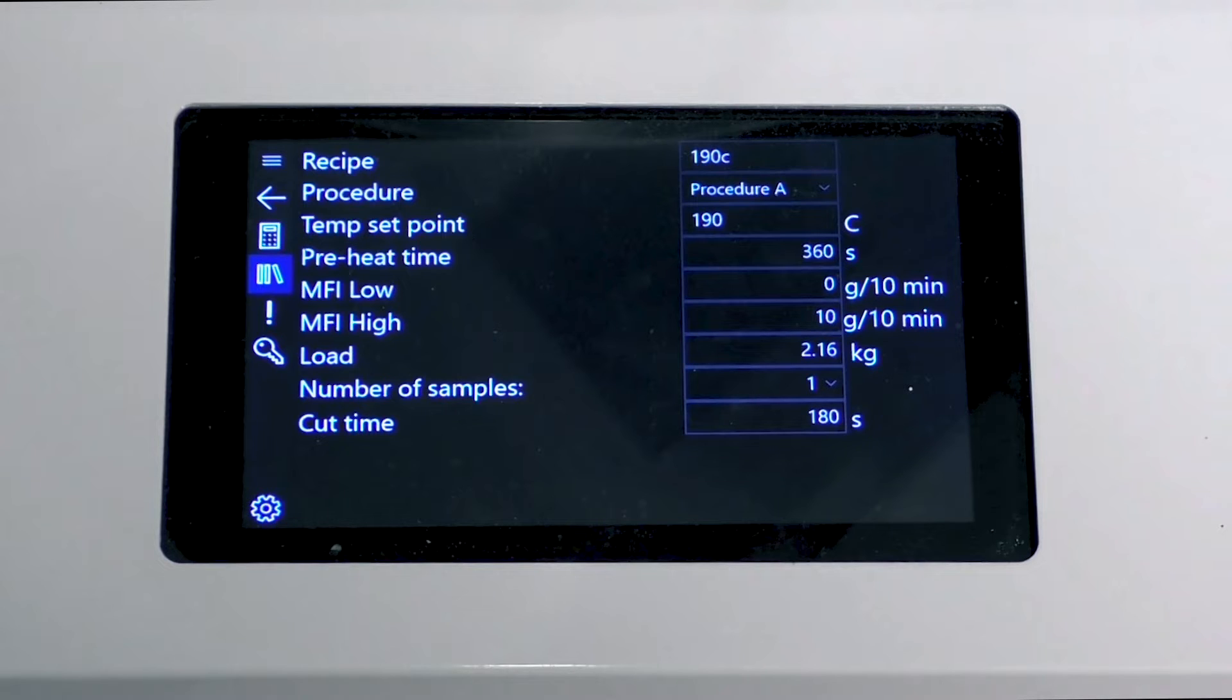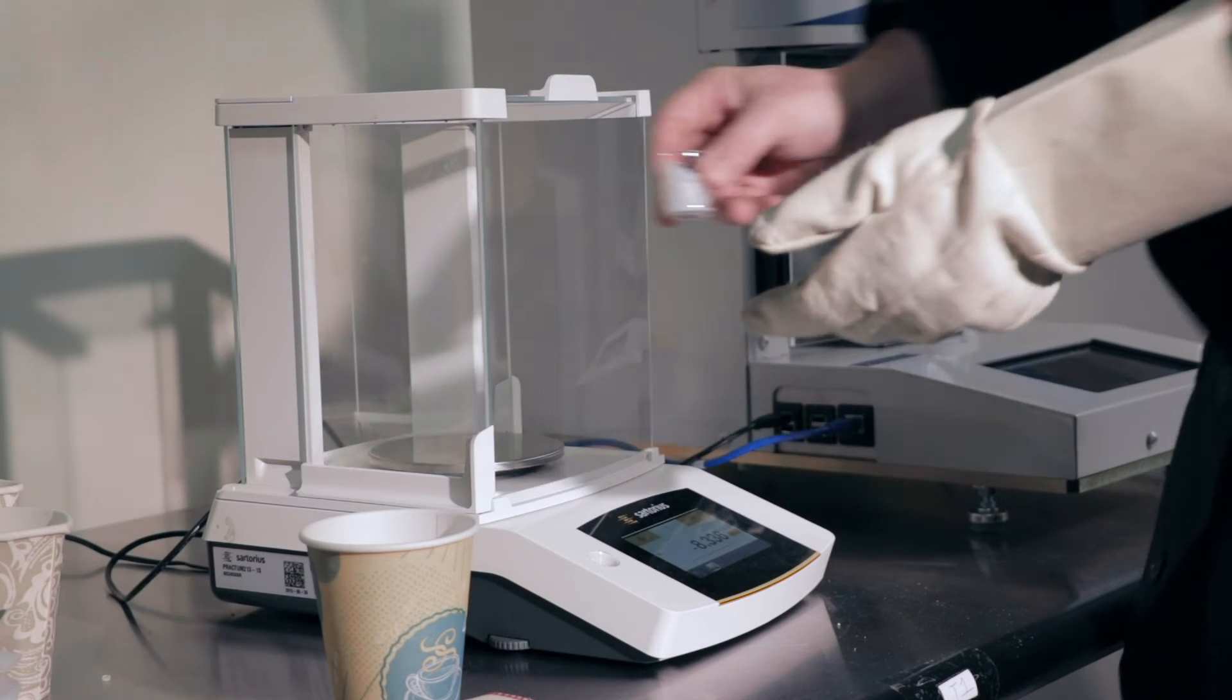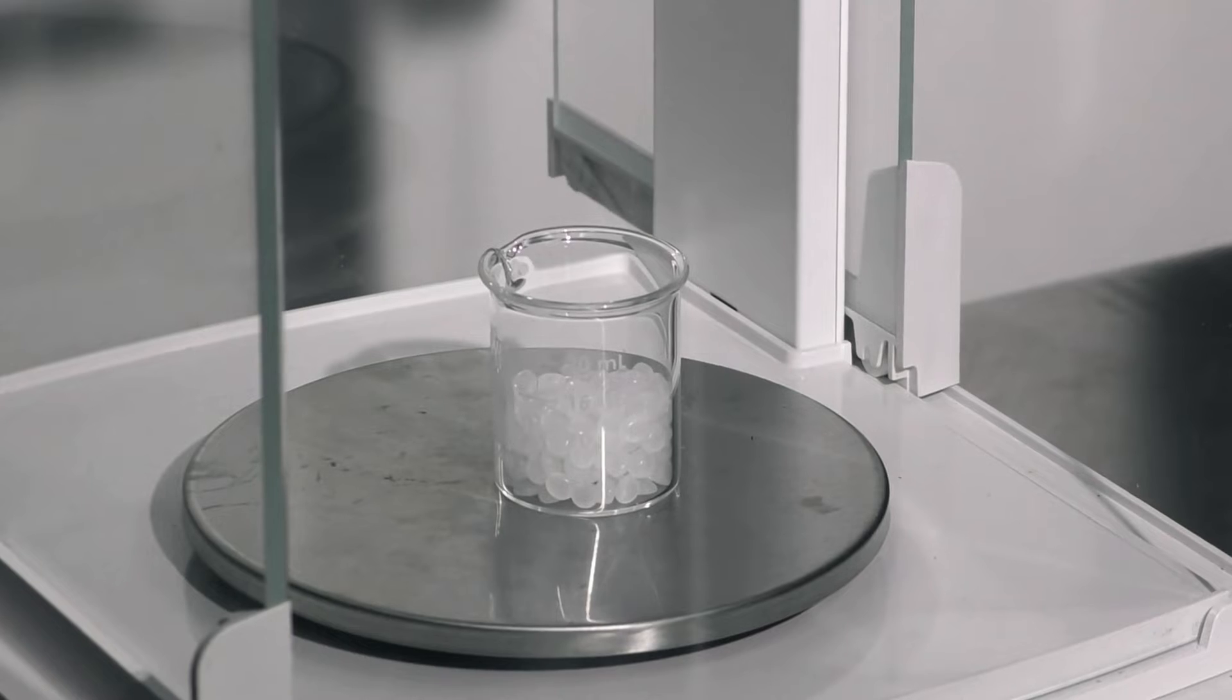The temp set point will determine at what temperature the polymer will be melted. Preheating time will clarify how long the plastic is preheated at the set temperature before the test starts. The cut time will determine how long after the preheating time the operator will wait before cutting the sample. The machine will heat while we continue to prepare for the test.